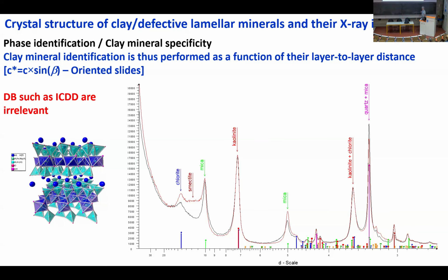When doing that, you have to think that during sample preparation, you have tried to get rid of random orientation. So you have tried to get rid of crystals being oriented with all possible orientations within your sample. Meaning that if you think about what we did at first, it was to try to compare all possible periodicities present in my sample to the database.